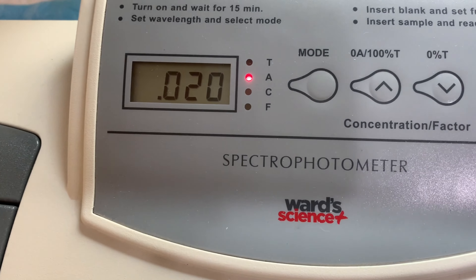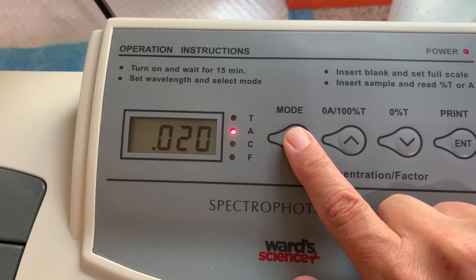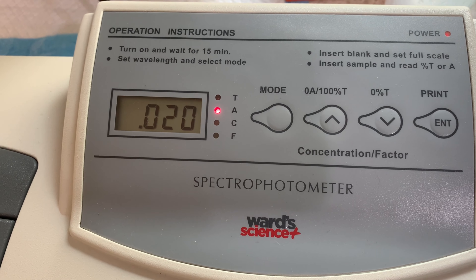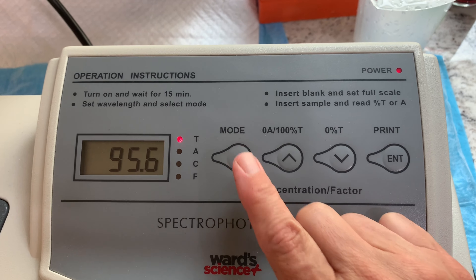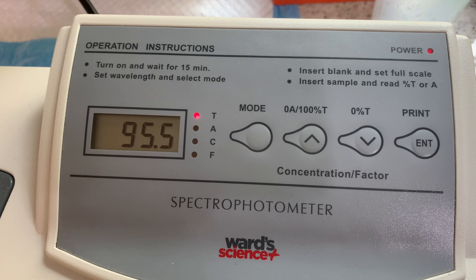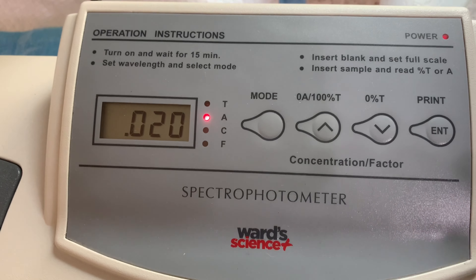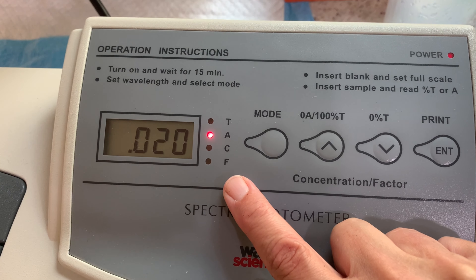Over here are the actual controls. First is the mode — you'll either want it on A or T. A stands for absorbance, so the detector calculates how much light is absorbed by the solution in the cuvette. T is transmittance — it calculates how much light gets transmitted through the cuvette. T and A are essentially the inverse of one another. Don't worry about C or F; C calculates concentration, and we don't use either in our class.